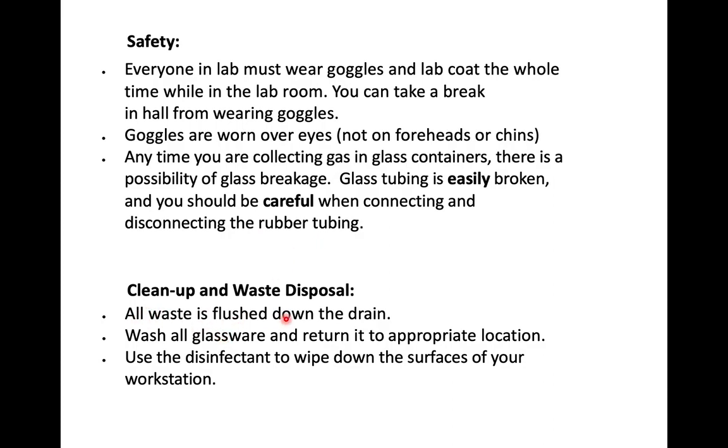Waste and cleanup. All waste is flushed down the drain with water. Wash all glassware and return it to the appropriate locations. Use disinfectant and wipe down surfaces of your workstation.